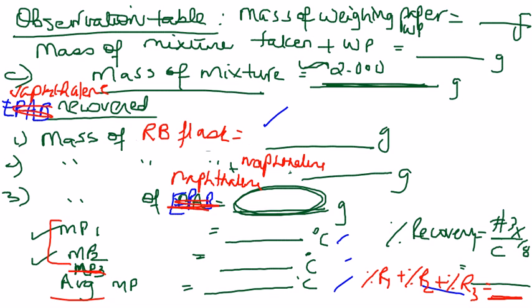If I were you, I would, in the conclusion section, compare all the melting point values to the true melting point of the benzoic acid, of the EPAB, and the naphthalene, so you can compare what kind of error you have gotten, and if that's acceptable or not. You should discuss that in the conclusion section.